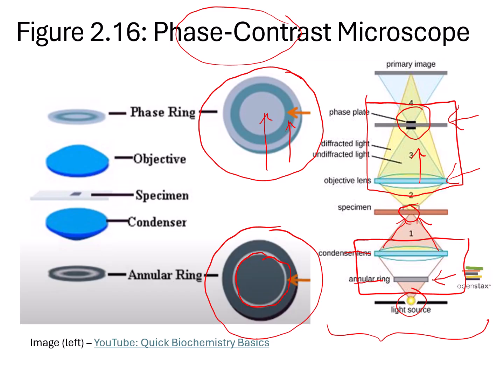And so ultimately, when the specimen is able to bend or refract the light, it's going to appear darker against a bright background of unrefracted light. And structures in your specimen that have different refractive indices will differ in their levels of darkness.